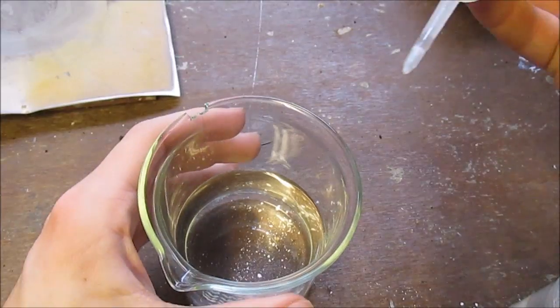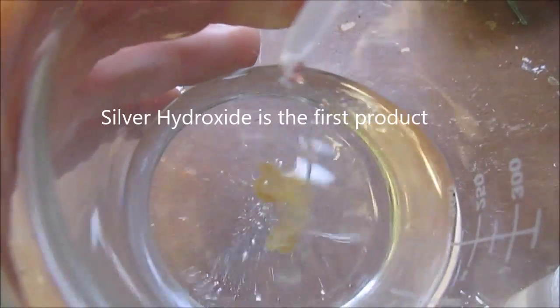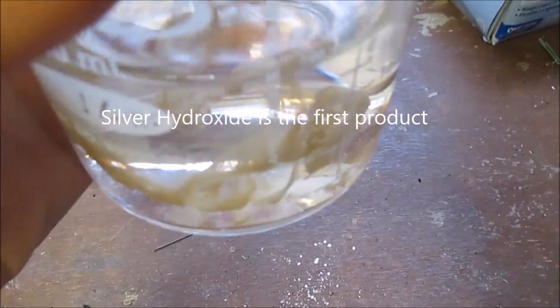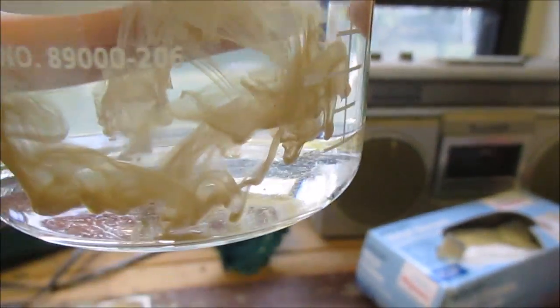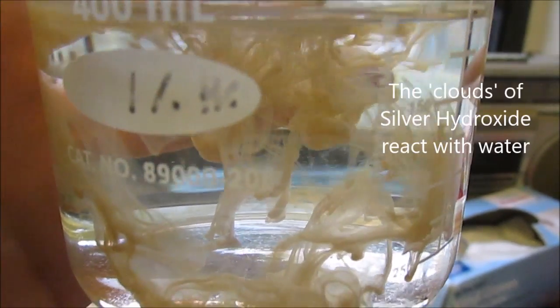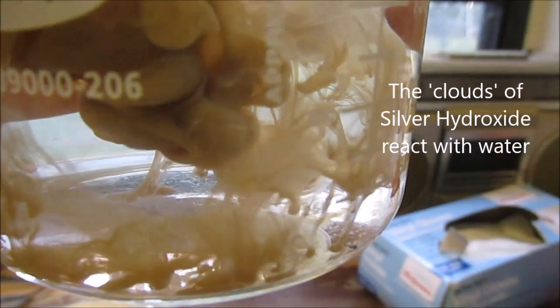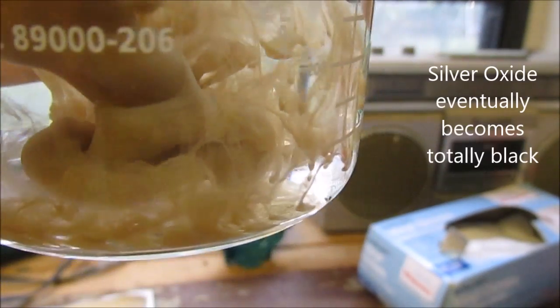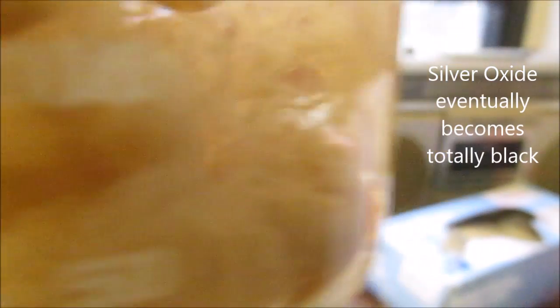Okay, and now for the moment of truth. There we are. We are breaking down into the much simpler — silver oxide, pardon me. And the silver oxide is the much darker color there. So there we are — that's silver oxide and silver hydroxide.